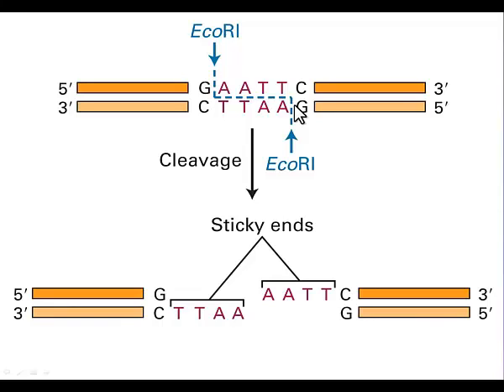So the first step of the Southern blot is going to employ this restriction enzyme digest technique, and this is basically being done to cut an entire genome, which is enormous. A human genome is enormous, and this is going to cut it up into a bunch of little pieces so we can actually work with it. So we can run it on a gel in an hour or a little more than an hour and actually see the size fragments separate. If you tried to do that with an entire chromosome, it would move very slowly, and it would just be very difficult if you could even find a gel with a pore size large enough for that to move through.